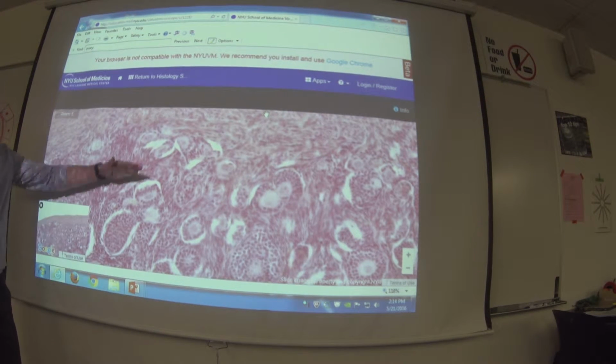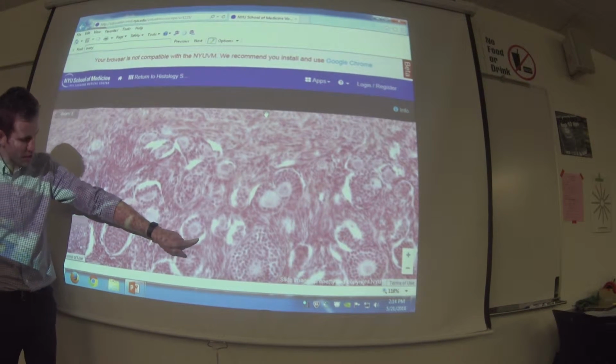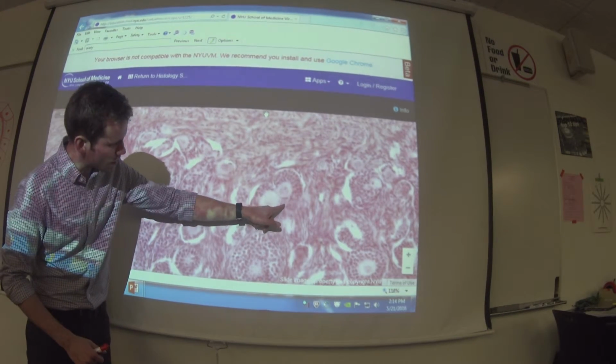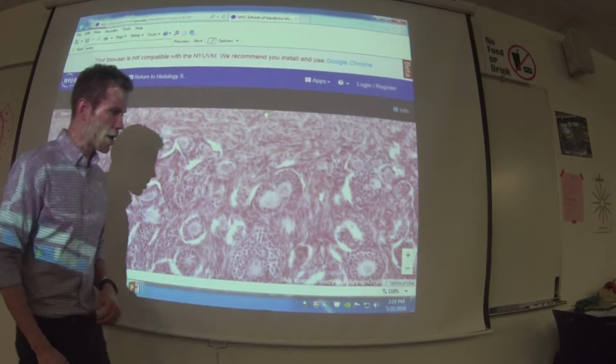type cells. As you move closer to the center, notice this one, that's I think a pretty good example. These are more cuboidal cells surrounding them. Single cell follicles just blown up a little bit. Same with this one here and this one here. It doesn't quite circle it perfectly, but that would be another primary follicle with a primary oocyte in it.